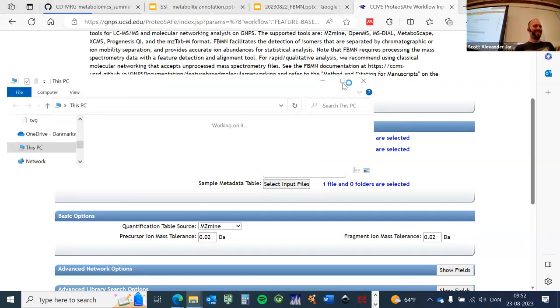There are a couple of questions online, will you answer them in the chat? I think it's relevant to people here too. It's like, where does the metadata come from? It's not an output, right? You need to generate it. I'll show it in a second. It is just in a folder higher up.